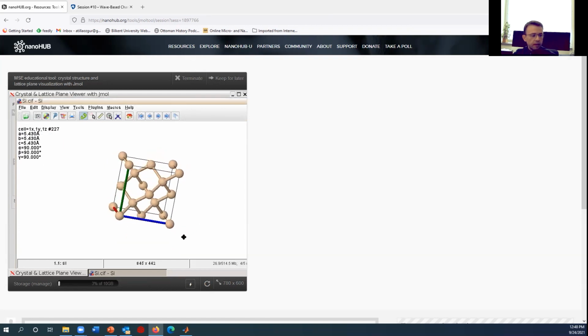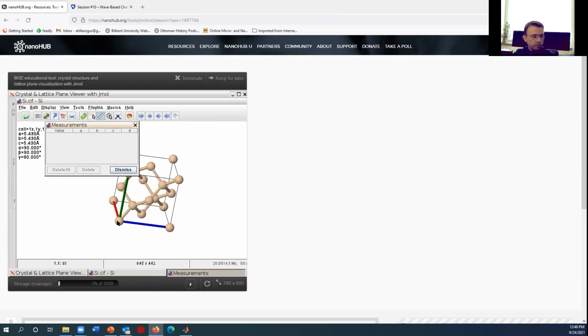And one of the things that I was telling the students is to get a measurement, like here you can get some measurement between the two atoms, the smallest distance, and like you can see here, 0.235 nanometers. And I'm always asking the students, how can we be very precise? What gives us this kind of precision? They do the measurement, but they don't realize that we're getting a super high resolution, right? This is below the nanometer, angstrom level and lower than that.